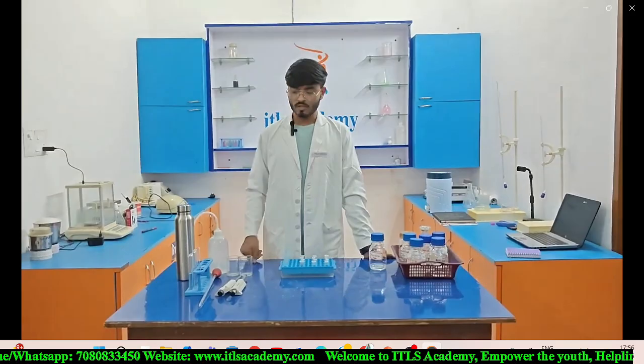So the very first step is we mark the Eppendorf. You can see here I mark the first letter of my name. This is T. So first of all we need to mark the Eppendorf. Secondly, what we need to do, we need to take a sip of water and rinse it up to 10 minutes.